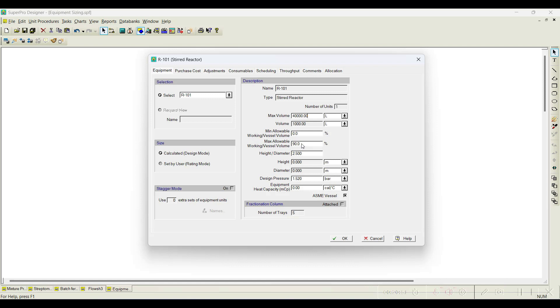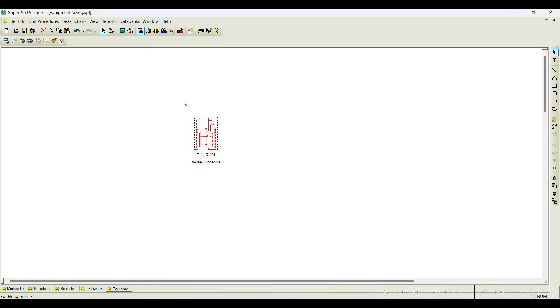You can also notice parameters like maximum working volume at 90% and height-to-diameter ratio — all these specifications you can provide in design mode. In case of rating mode, I know the size of my equipment, I fix it, and all other parameters I can also fix. In this tutorial, I will show you an example of how this sizing will happen.